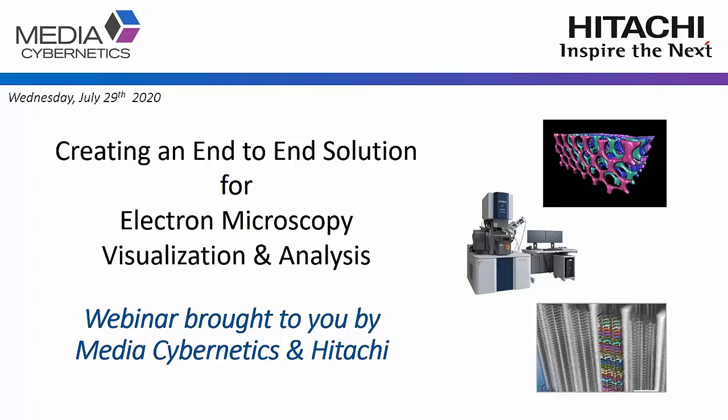So today's discussion is going to revolve around creating an end-to-end solution for electron microscopy and visualization and analysis.